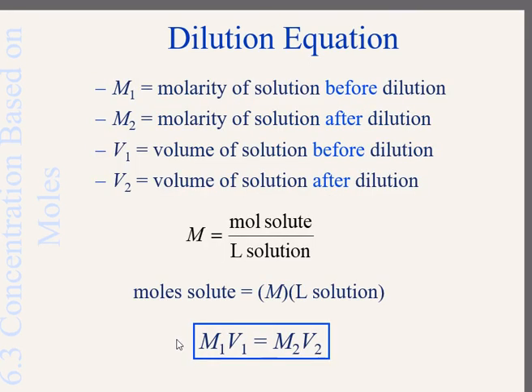Now, how exactly do we perform a dilution in the lab? In reality, we don't store our solutions in beakers, but there are other special containers, special glassware made just so that we can make solutions and store them. Usually the lab tech would make a concentrated solution in a glassware called a volumetric flask and then store it in stock bottles.